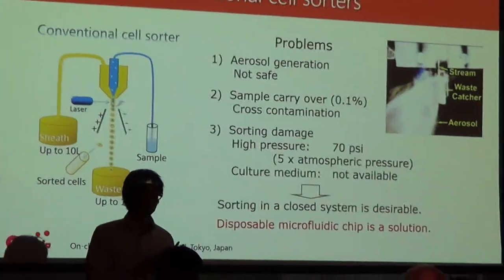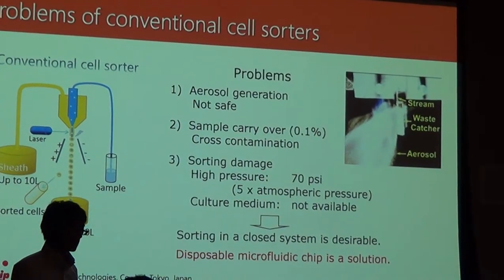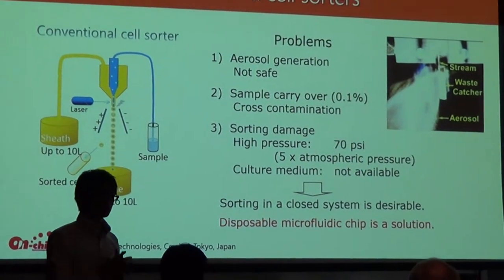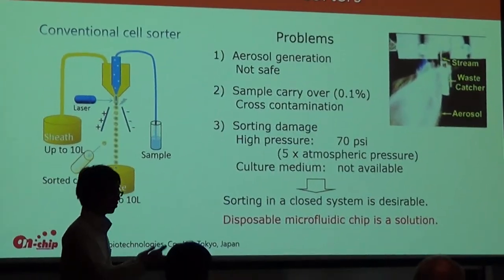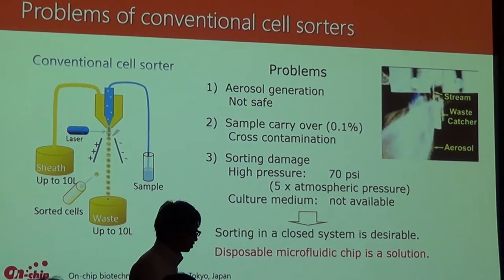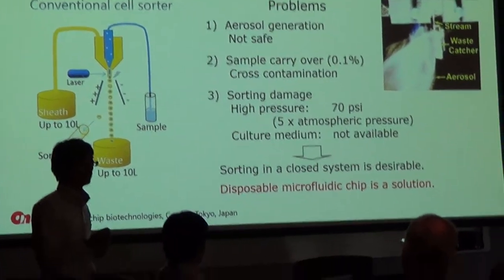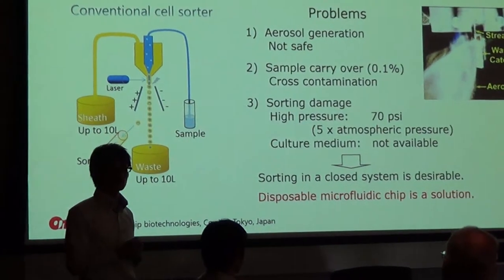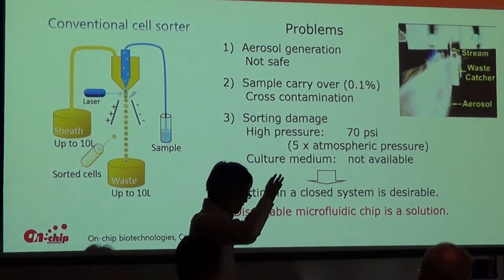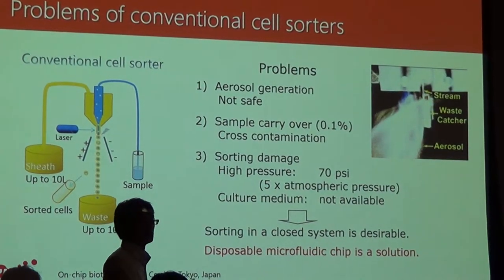And also the sorting damage that I briefly mentioned earlier. Like I said, with high pressure, the shear stress that all the cells undergo is just so high that weak cells just tend to break away, and there you go. When you thought that you collected your samples, they don't mean anything to you anymore. The culture medium that he also mentioned earlier: the conventional sorters specify particular solutions to use. He's going into a bit of detail on that, so I may not touch on that later. But anyway, as a problem, what we need is a closed system so that all the vapors would not get to you and all that.